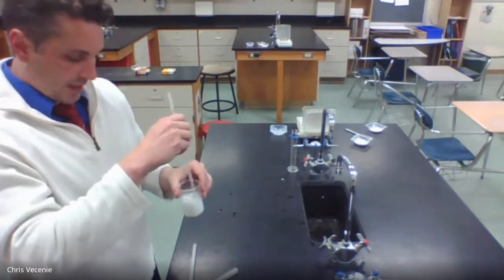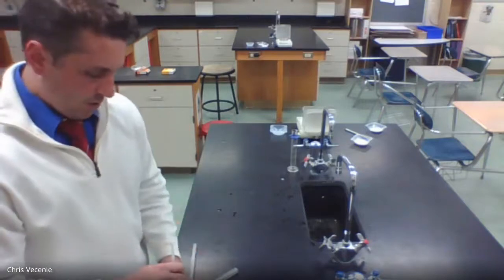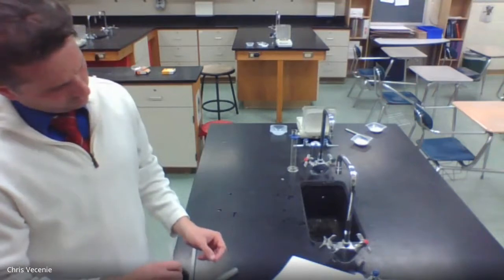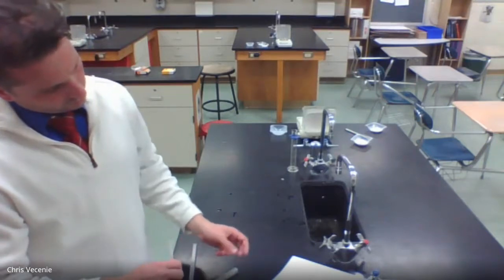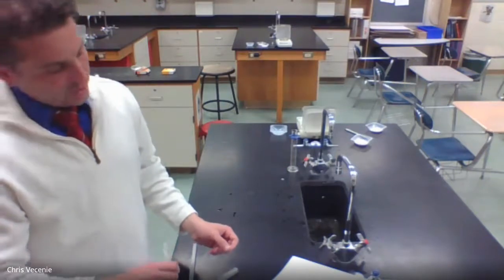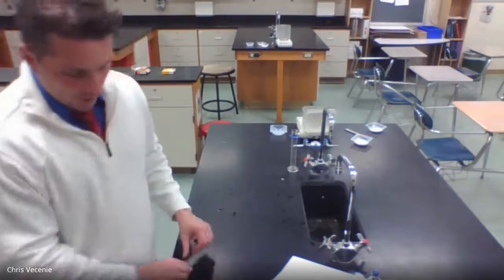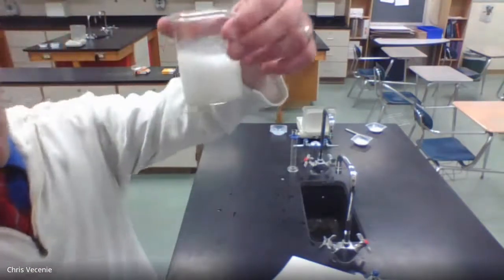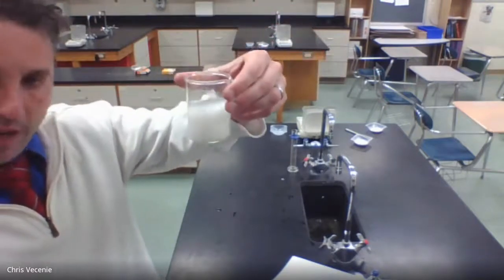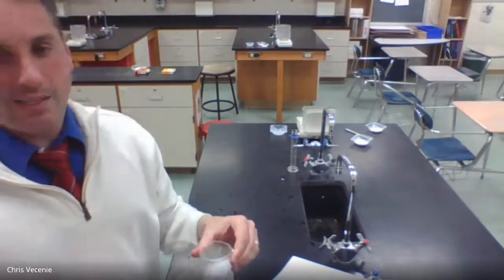In your packet, it says you should stir this for about, actually, it doesn't give you time, so I usually just add that part and say stir it for about 2 minutes. All right, so this white milky looking stuff is actually calcium carbonate that's got all that other stuff mixed in with it. So we need to isolate this.